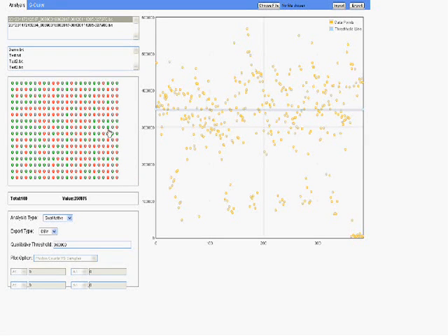And then you can also see the wells as an array tape formation, so you can visualize it that way, and you can see which ones were a hit in green, and what was a miss in red. And that can be exported so that you can use that data in a different kind of file of your choice. So tab separated values, text, Excel, and comma separated values. We'll just use comma separated values for now.